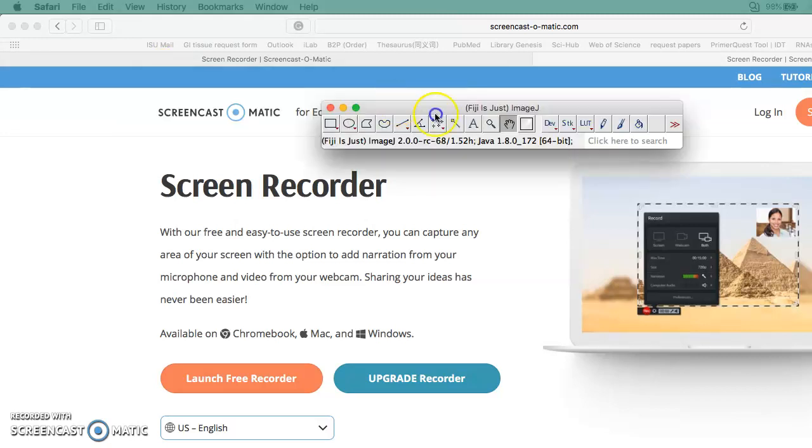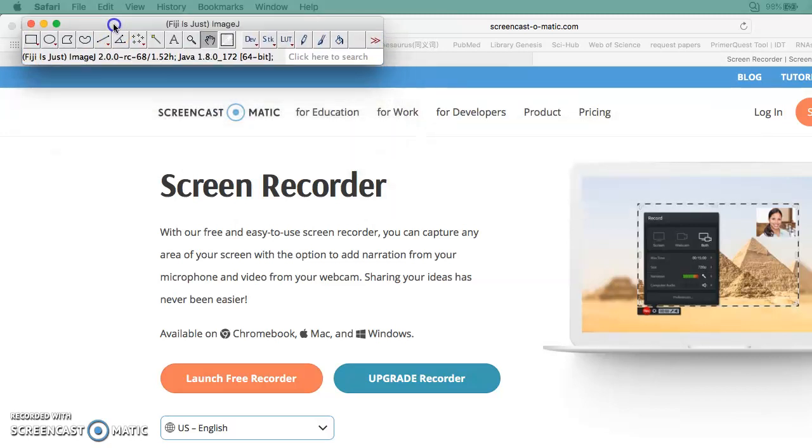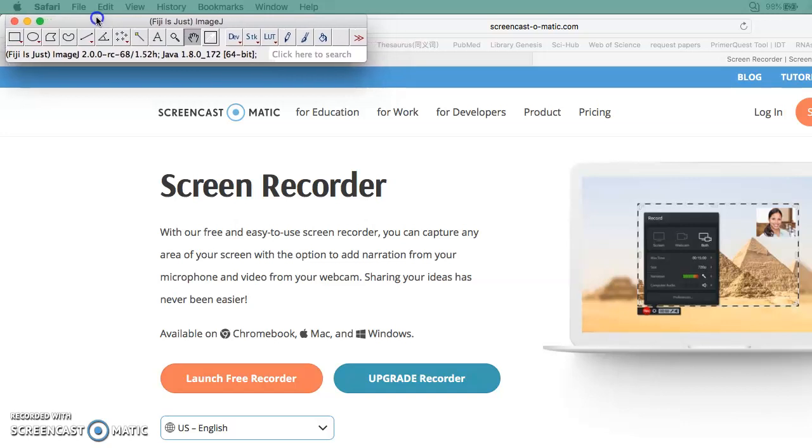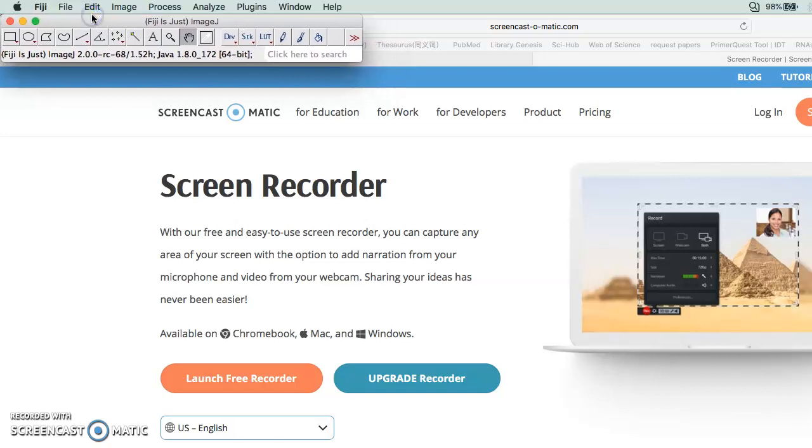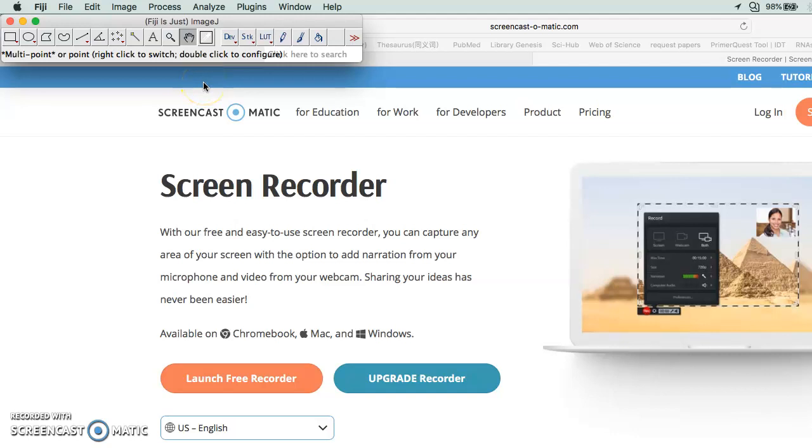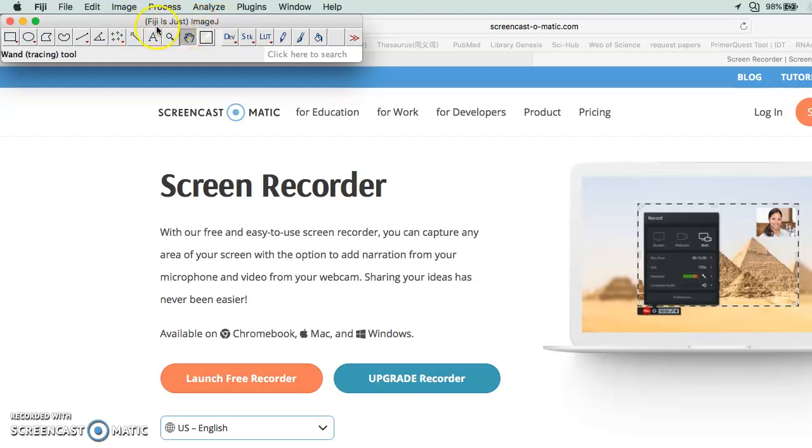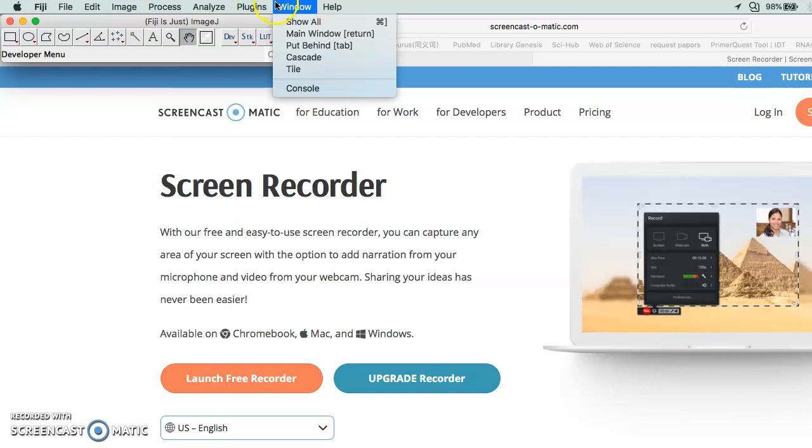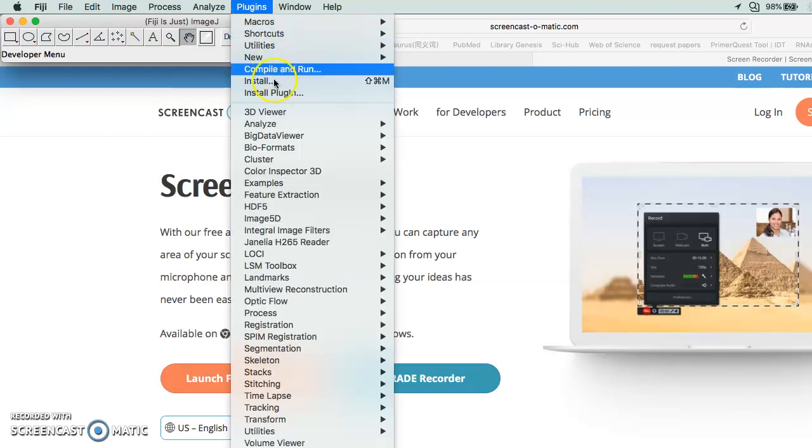For Mac users, the 3D viewer is actually not working in ImageJ, so you need to download a program called Fiji instead of ImageJ. This one actually does have a plugin for the 3D viewer.